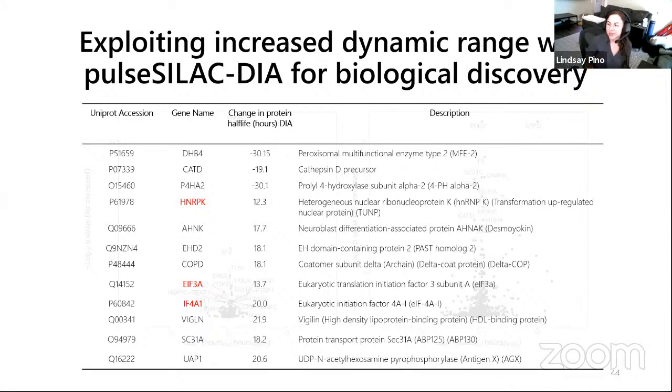It kind of makes me wonder, this decrease in the cathepsin D, this CAT-D protein, the second one here, could it be explained by, one, an increased synthesis rate? Cathepsin D is an aspartyl protease, so it's kind of maybe orthogonal to the ubiquitin proteasome pathway as a protease itself. Maybe cells are trying to upregulate this protease activity to try to clear out some of these accumulating proteins that aren't being degraded normally.